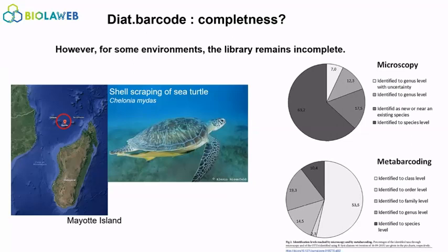When you have a lot of data, you can give a name to these unknown sequences with more confidence, because you can also make some correlation between DNA and microscopic data. You can make several phylogenetic assignations in the tree. So we are much more confident with dominant species than with rare species. Rare events are always complicated.